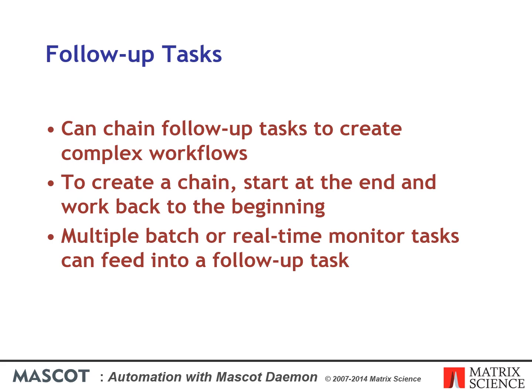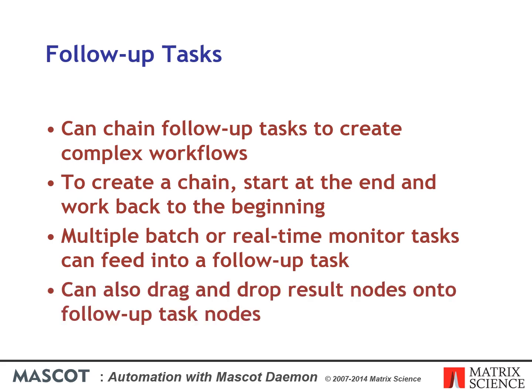Having created a follow-up task or a chain of follow-up tasks, multiple batch or real-time monitor tasks can feed into this chain. It just sits there waiting for data files. Note that any result node can also be dragged and dropped onto a follow-up task node to repeat the search using a different parameter set.